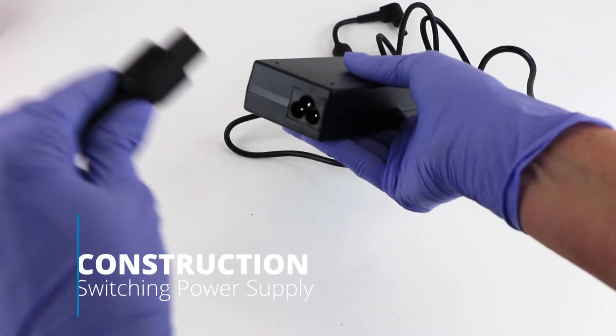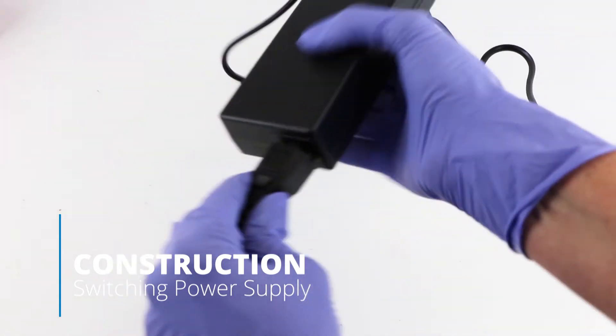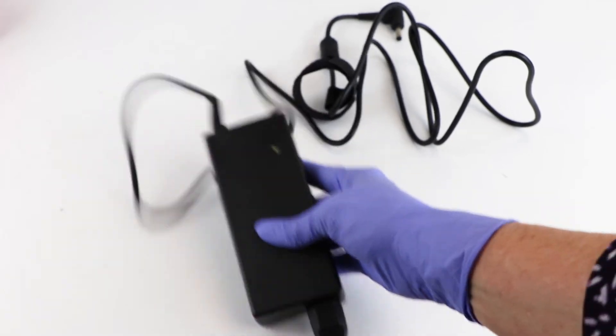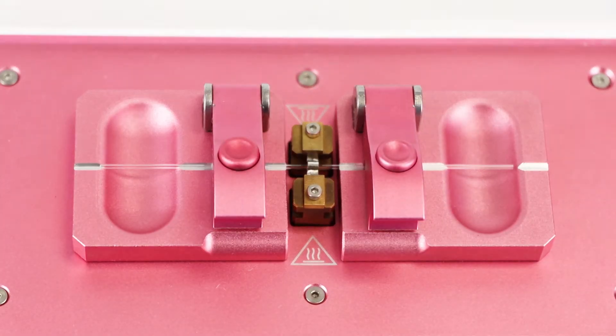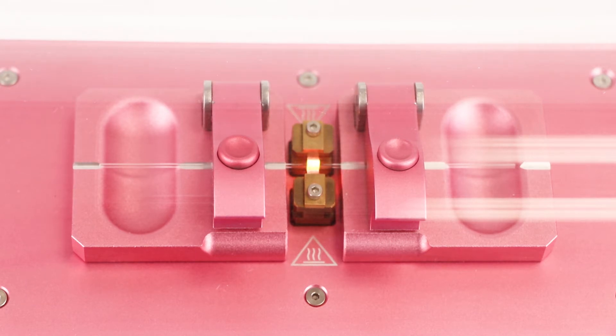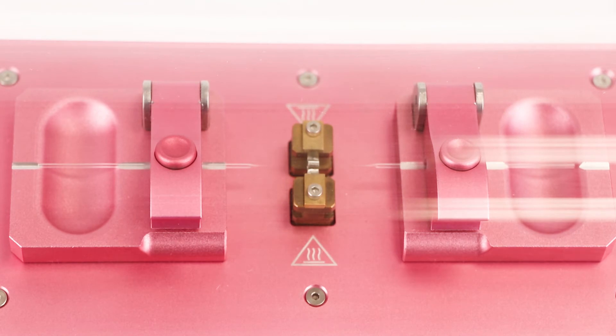The Pull 1000 has a switching power supply for use anywhere without worry about line voltage differences. Pulling reproducibility is unaffected by line voltage fluctuations. Heating voltage can be controlled to within one-tenth of a percent accuracy even when line voltage fluctuates from 100 to 240 volts AC.